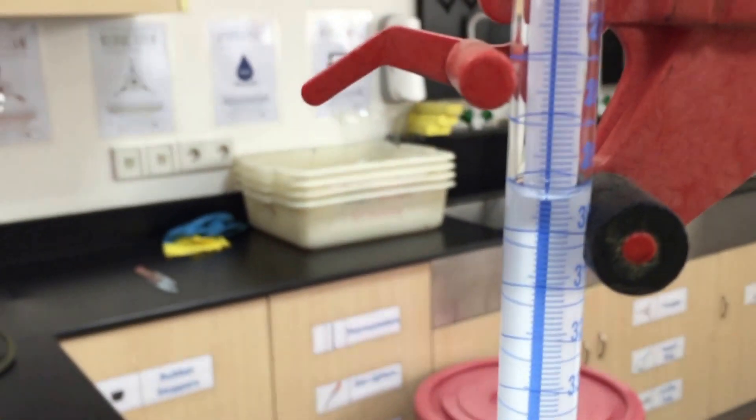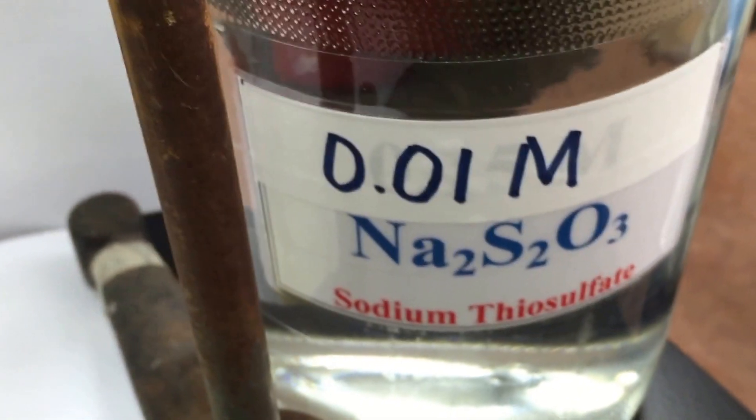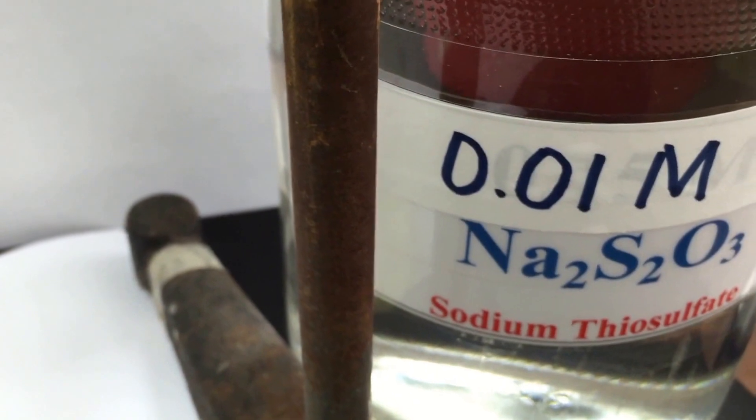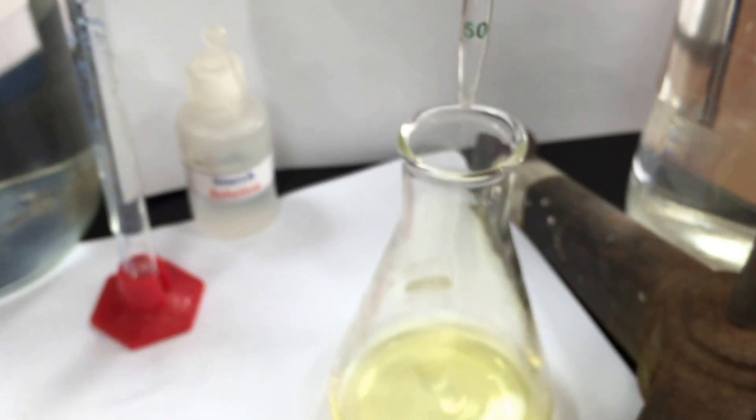So in my burette, I have accurately measured the initial volume, and this is the stock solution, which I used to create a 0.002 moles per liter solution. So I have 0.002 moles per liter standardized solution in the burette, and now we're going to titrate.